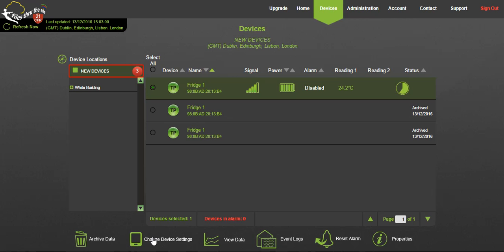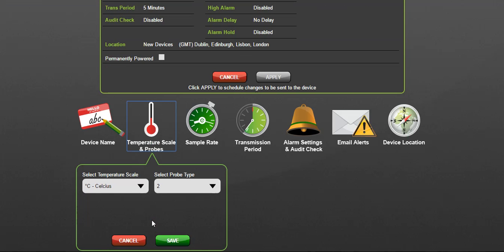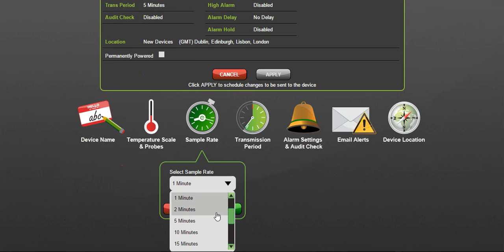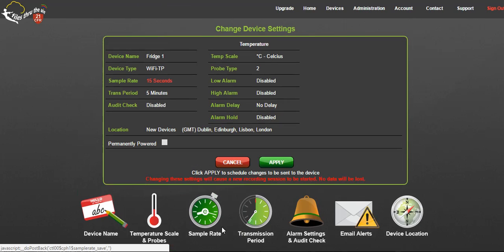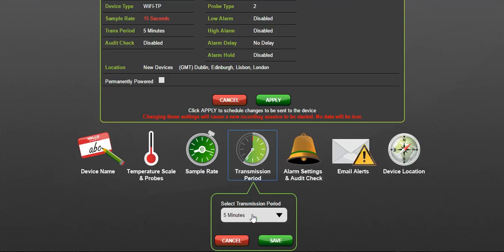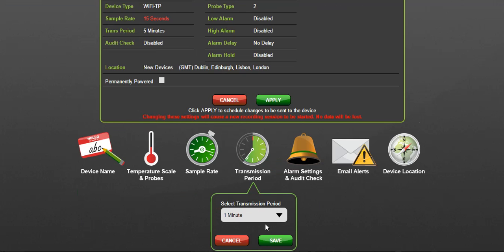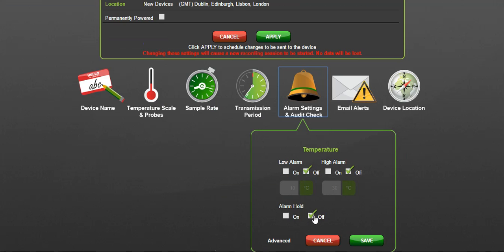Each device is saved to the cloud with a standard default setting. To view or change any of those settings, select the device and click the change device settings tab. Here you can change the name of the device, the temperature scale, the rate at which the logger samples, the rate at which it transmits those readings to the cloud, alarm settings, email alerts, and the device location.